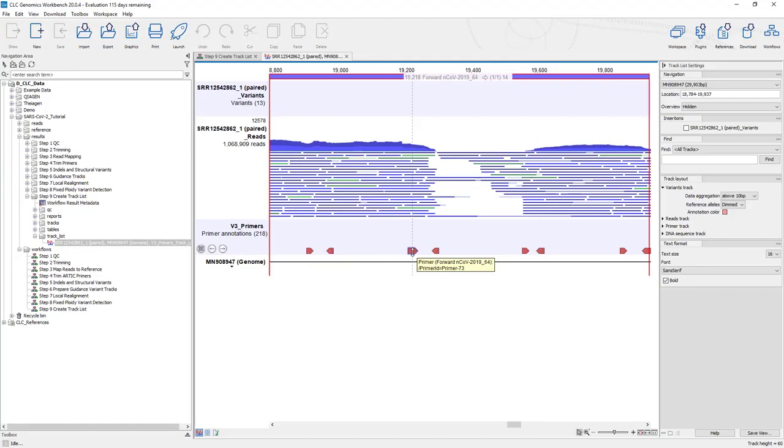So we see this is for the Amplicon 64. These two primers, for some reason, aren't amplifying very well there. And so you can go in and find your problem areas as well. So this to me is a really powerful tool.